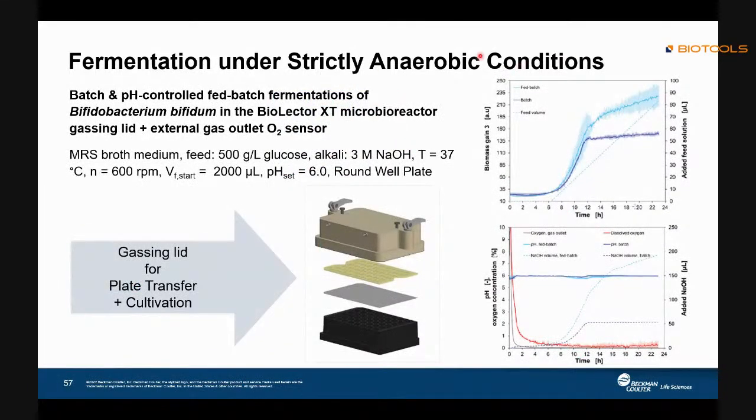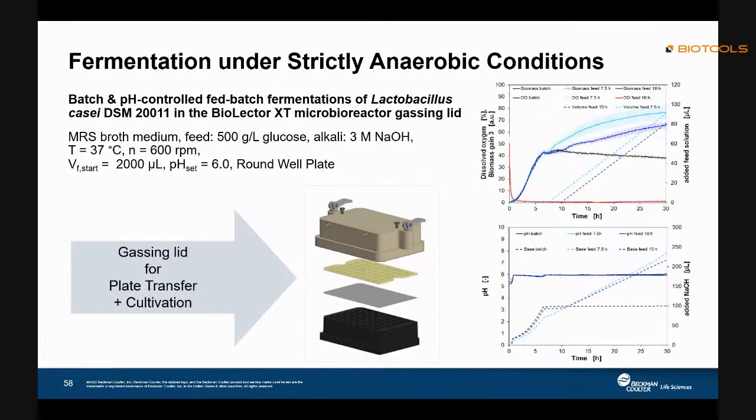So this is the example that we have used, with the feeding of glucose and alkaline. So we can see the data for them. And also if we change to a different type of measurement, another type of microbiome, what will it look like? So this is the anaerobic method, for when your fermentation really needs to be without oxygen.